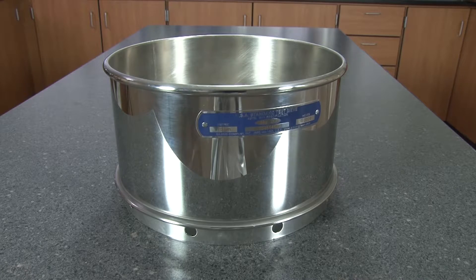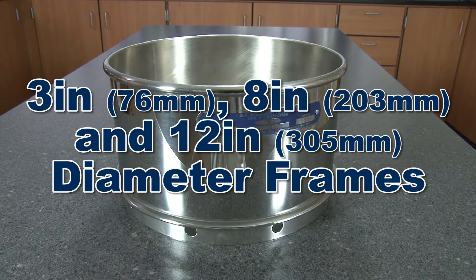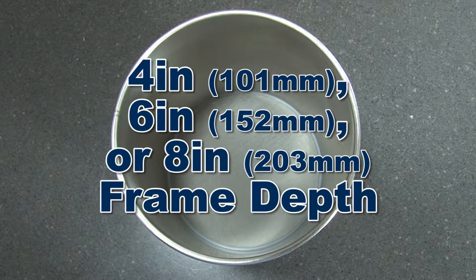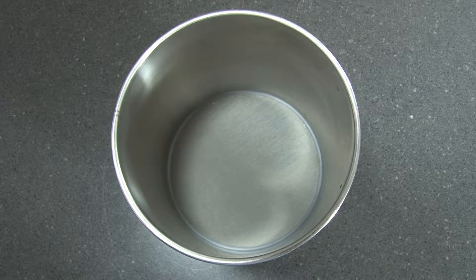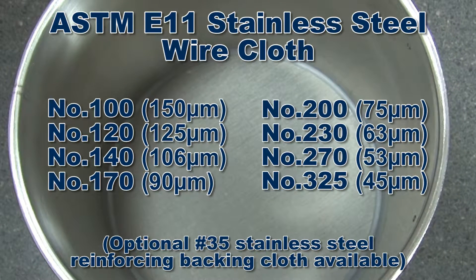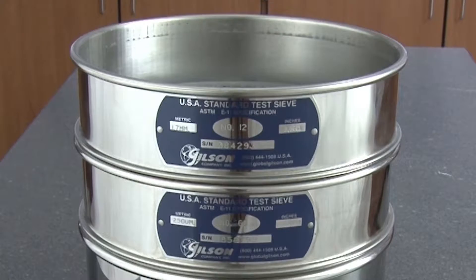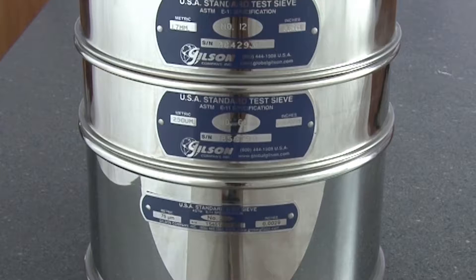Stainless steel deep-frame wet wash sieves are available in either 8 or 12 inch diameter stainless steel frames, in either 4, 6, or 8 inch frame depth. All have permanently mounted stainless steel wire cloth from number 100 to number 325, and stainless steel deep-frame wet wash sieves can easily nest with standard sieves.